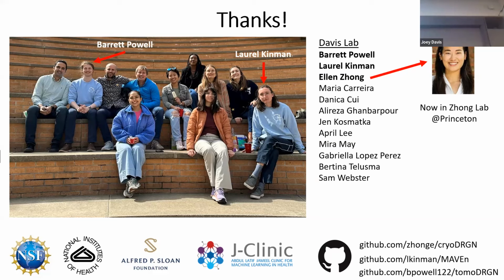And so we and others have done a couple things where you try to, for example, directly infer the atomic model from the particle images. And there you can imagine using priors based on sequence to structure predictions to help guide that. I think the danger is that you overfit to your model and you have this self-fulfilling prophecy of getting back the structure that you gave it, independent of the data. And so it's getting that trade-off right, but I think that there's promise there. Something we haven't spent a ton of time on, but worth thinking about.